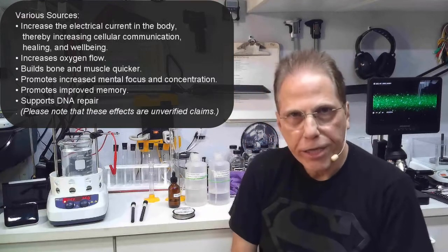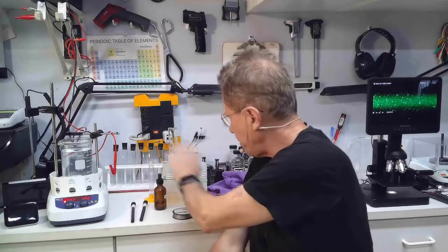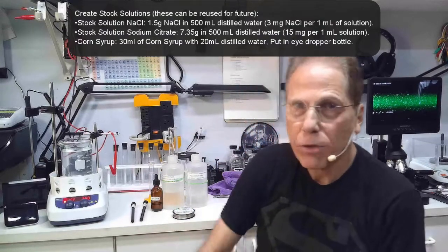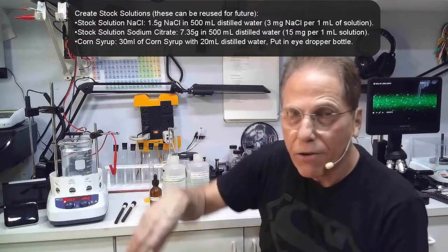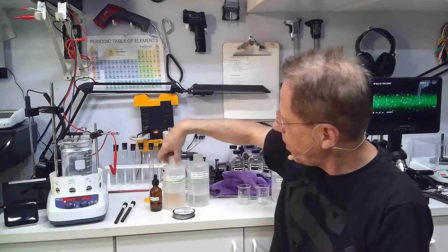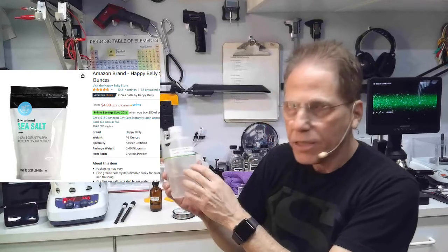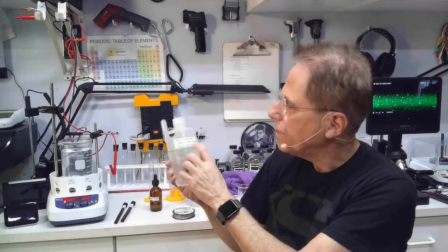Titanium is one of the trickier metals to make. It requires the gold formula, which is corn syrup, NaCl, and sodium citrate. That requires you to make stock solutions. As I've pointed out in my gold video and stainless steel video, you have to get some sea salt or NaCl — no iodine.